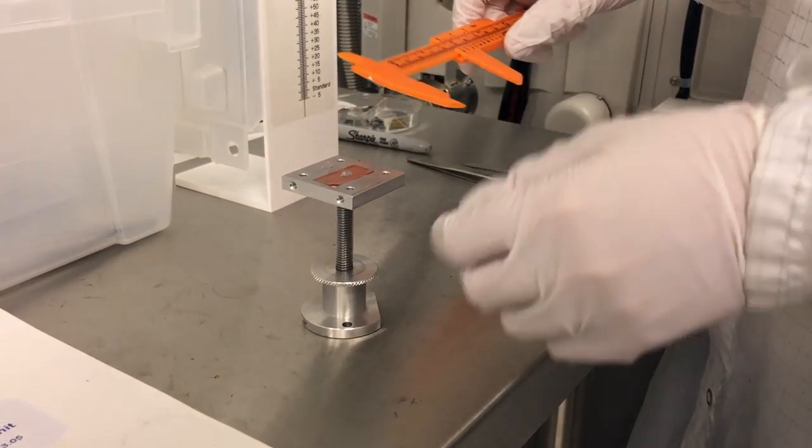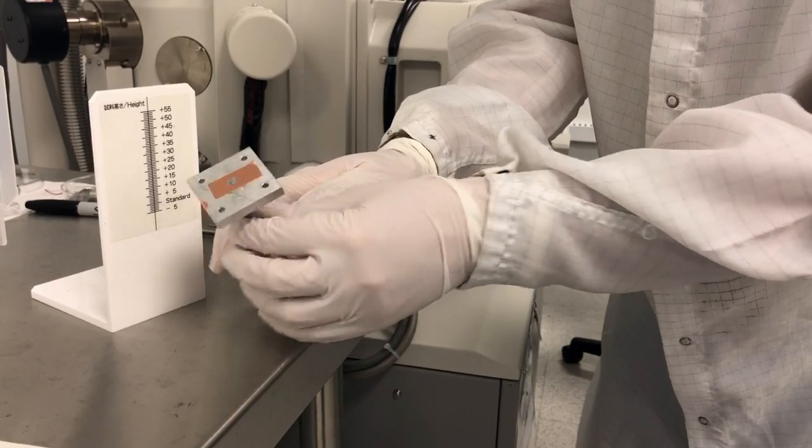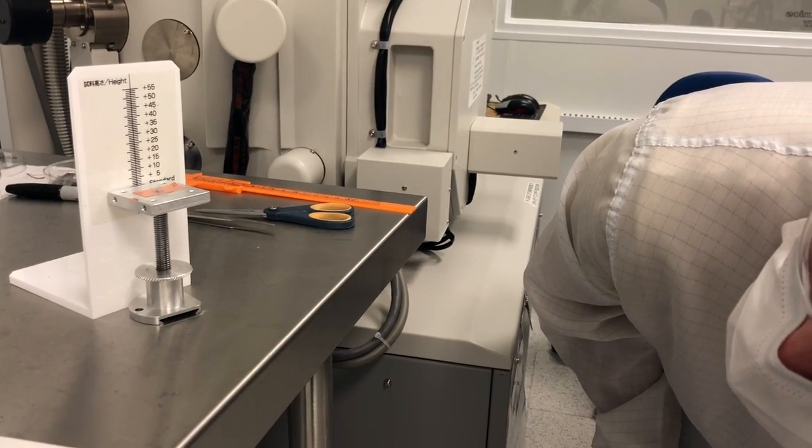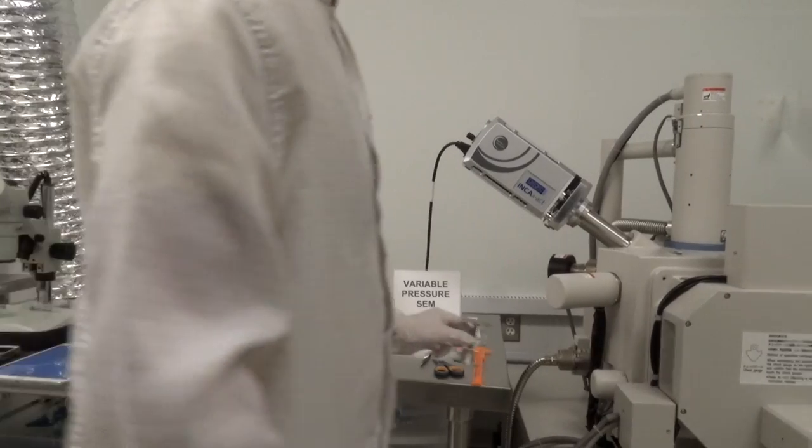When your sample is properly attached to the mount, measure the width of the stage as well as the height from the top of the sample. Measure width with the orange caliper and height with the height gauge. Open the specimen settings screen in the PC window and enter the measured height and width into the pop-up window.